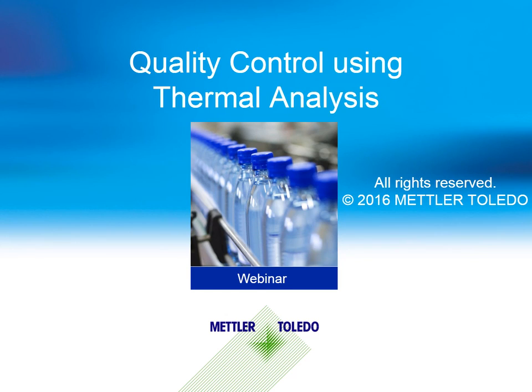In order to achieve correct product quality and performance, many manufacturers have set up a number of quality control procedures to ensure that quality and specifications are consistently met. Thermal analysis is one of the many tools used to monitor the quality of materials and manufacturing processes. Thermal analysis techniques provide fast, accurate, and reproducible results.